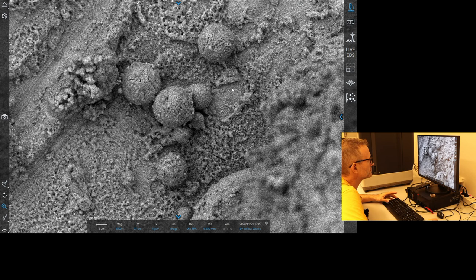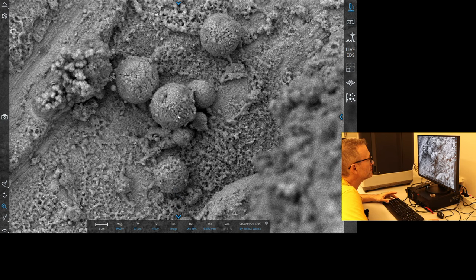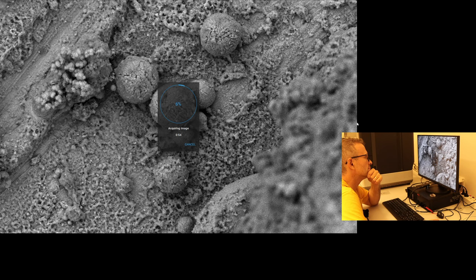These look like a whole bunch of iron-rich crenellated spheres, fairly badly formed, of various scales. And they appear to be coated with some other stuff, and I would hazard a guess that that is silicon dioxide, maybe, on the outside, maybe with some calcium. So maybe we'll do a quick map of this just to get an overview of what's going on in this area of the reactor.